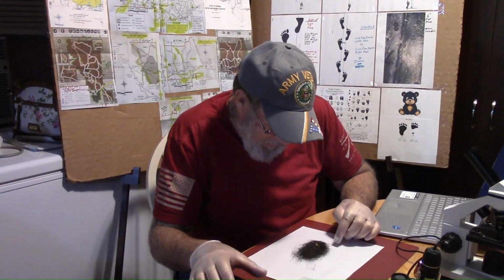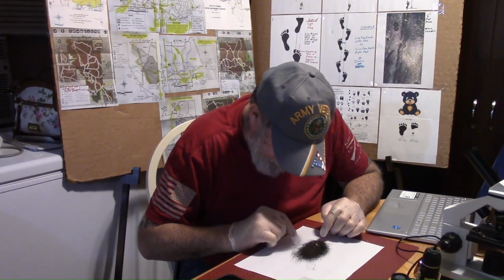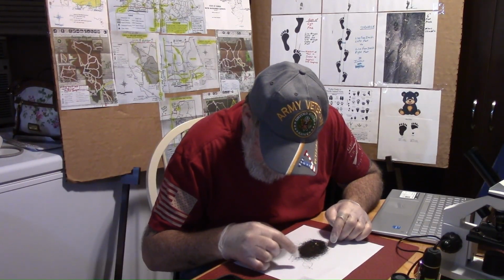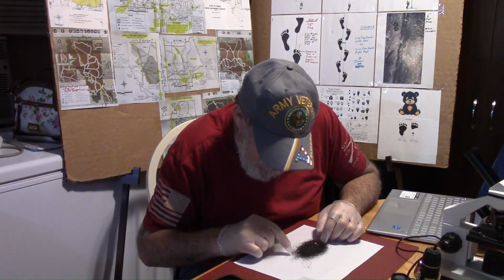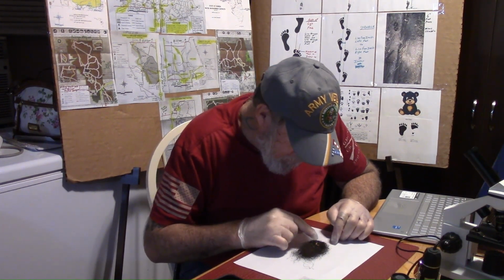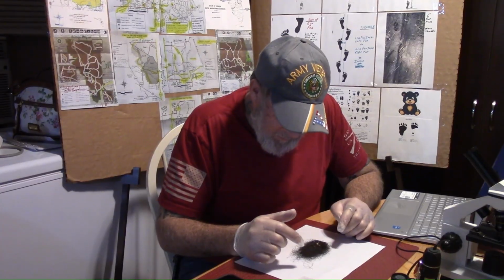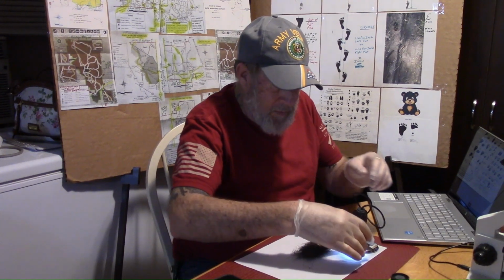Alright, so just a quick look. These do look like hairs. They do look like hair. It doesn't look like the vine moss. And I'm trying to look at some of the ends of it. Alright. So let's get started, I'll get started with the digital microscope. Here we go.